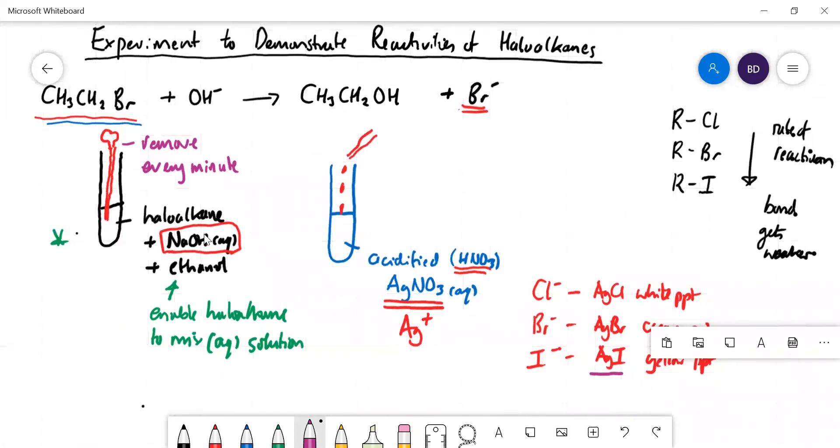So you're going to release iodide ions which then react with the silver ions. That is just a fairly rough and ready experiment to prove the order of reactivity. You should get the precipitate forming first with the iodide, a little bit more slowly with the bromide, and the chloride slowest of all.